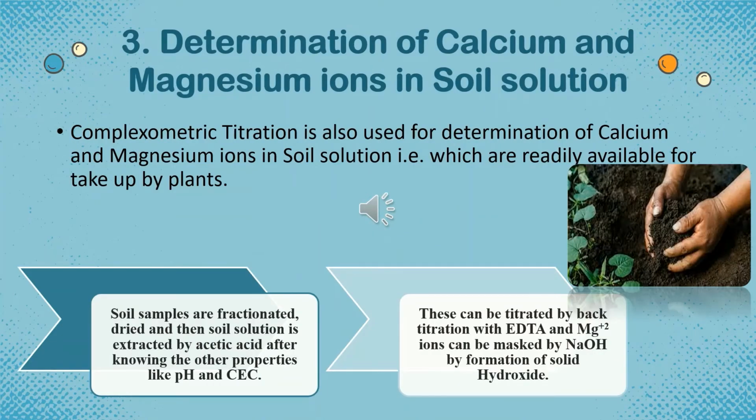Third application is determination of calcium and magnesium in the soil solution. Soil solution is the medium in which surface and solution reactions occur. This aqueous solution contains dissolved matter from the soil chemical and biochemical processes, and from the exchange with the hydrosphere and biosphere.